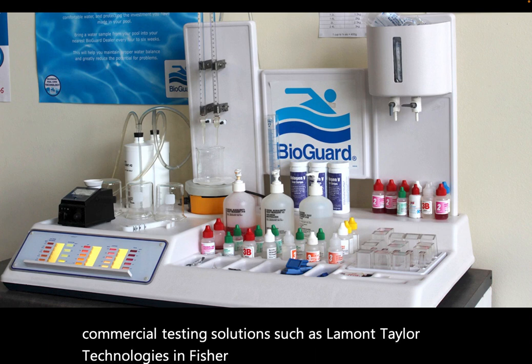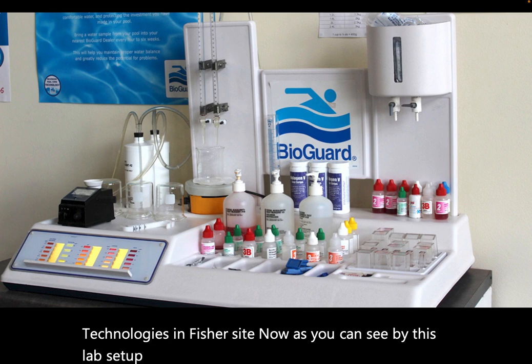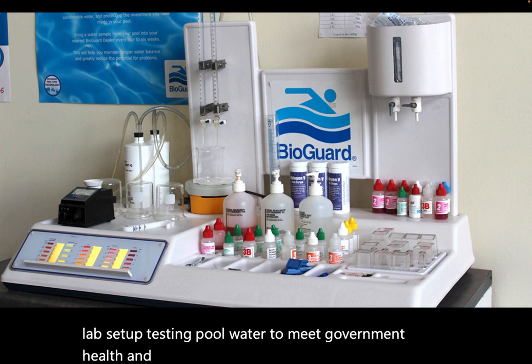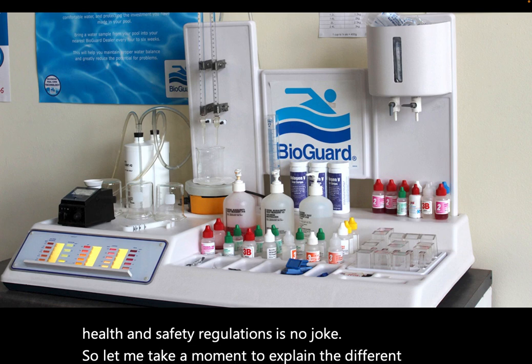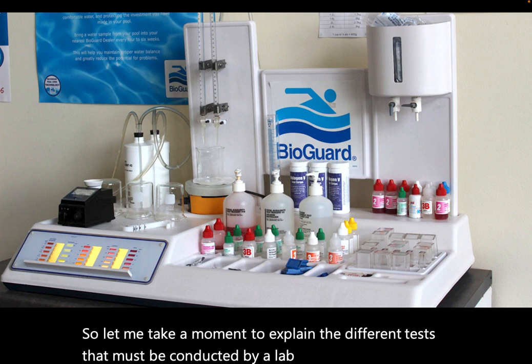Now, as you can see by this lab setup, testing pool water to meet government health and safety regulations is no joke. So let me take a moment to explain the different tests that must be conducted by a lab tech to ensure that all health and safety requirements are being met.